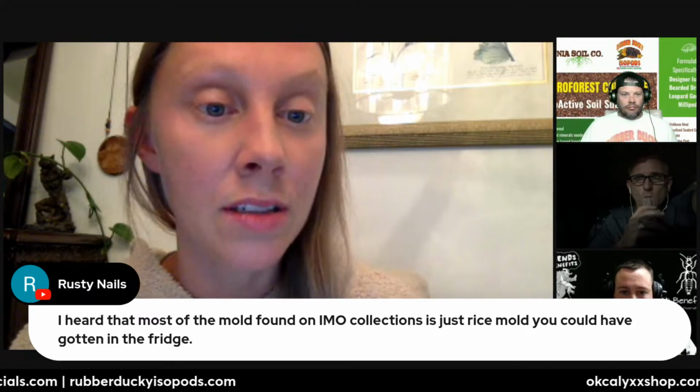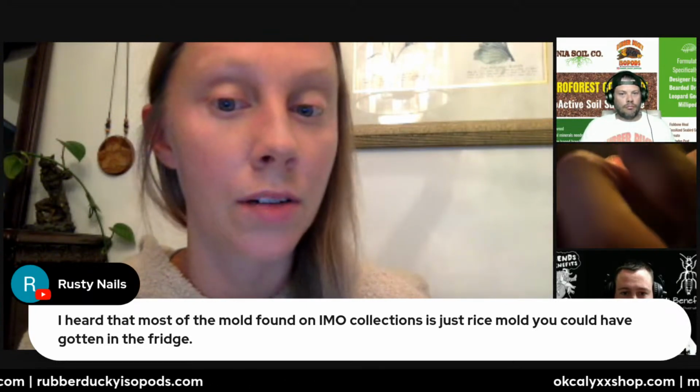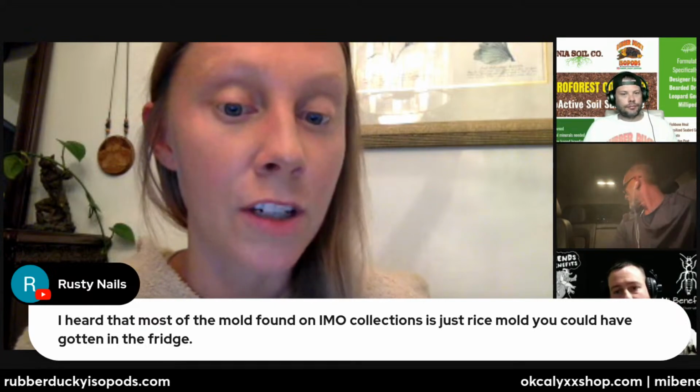Yeah, I've heard this as well. It's really hard to say without a genetic test, but I will say that looking at the IMO2 collections under a microscope, it's not the diversity that you would maybe expect. So a lot of people say that it's an organism called Rhizopus, which is a zygomycota. It's a less evolved organism or type of fungi.